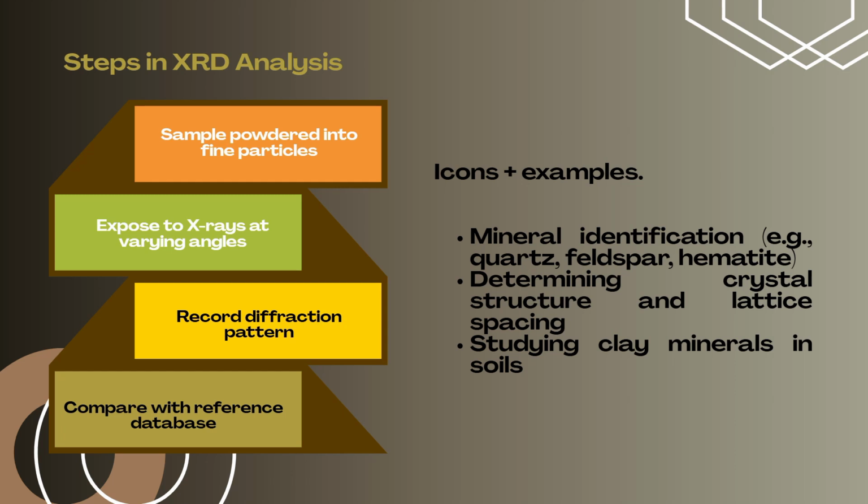Applications and examples. We have mineral identification such as quartz, feldspar, and hematite, determining the crystal structure and lattice spacing, and studying clay minerals in soils.